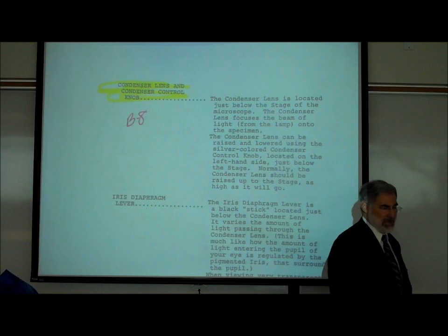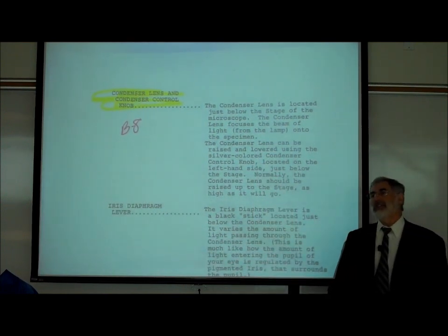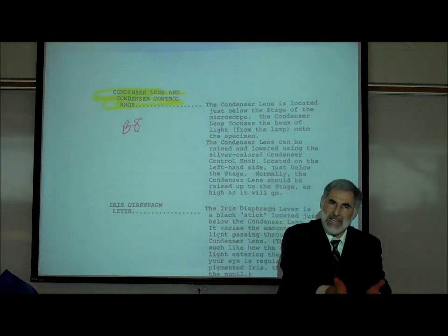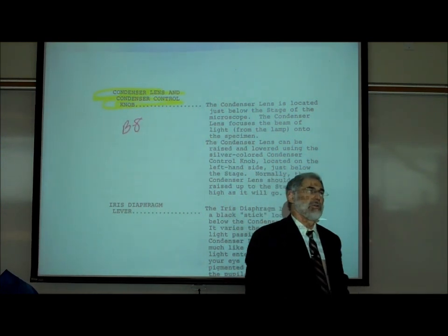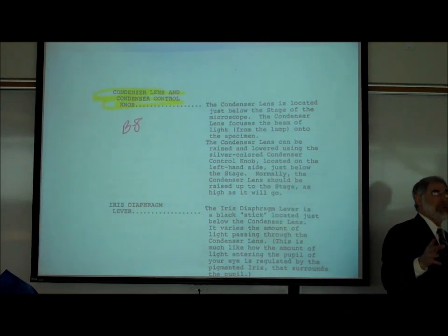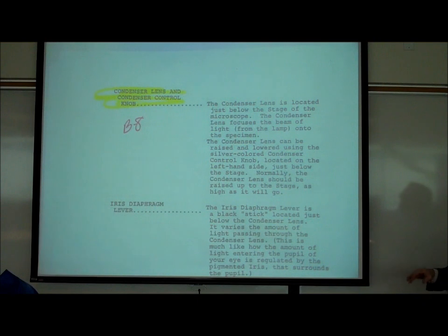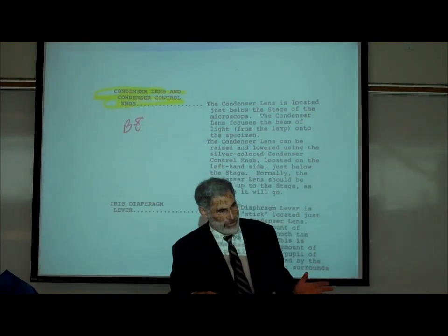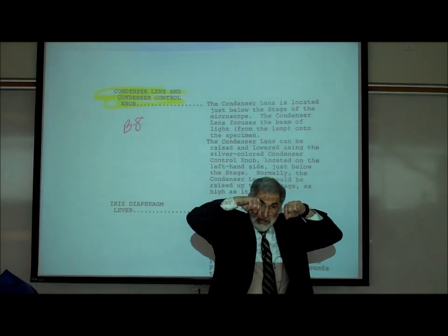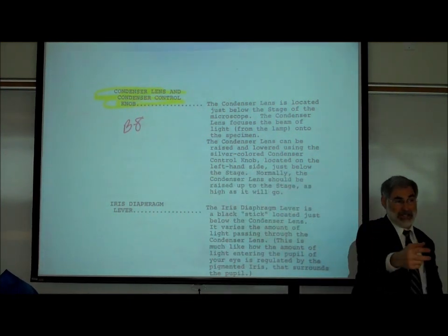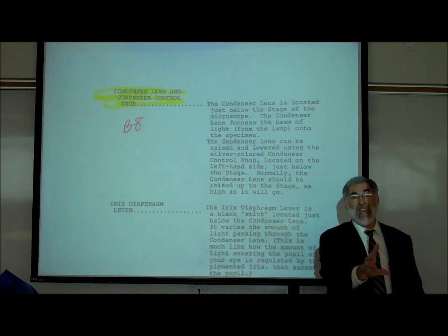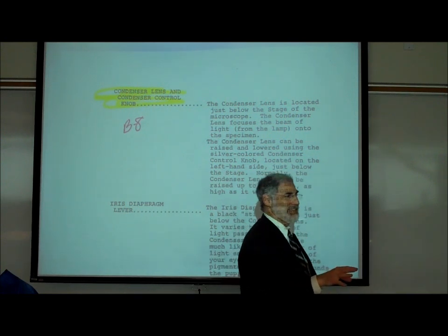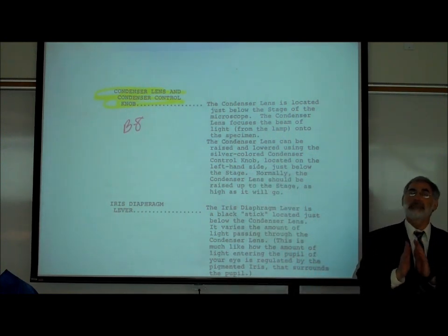When you turn that black knob, raising the condenser lens up or down, you use it to focus the beam of light better on the specimen. This is the only lens on your microscope that has nothing to do with magnification — the condenser lens's purpose is not to make something look bigger, but to focus the beam of light.